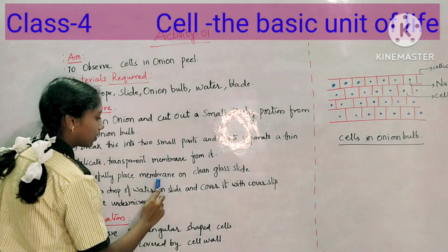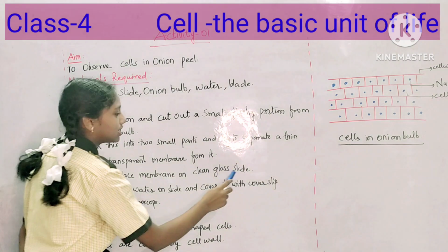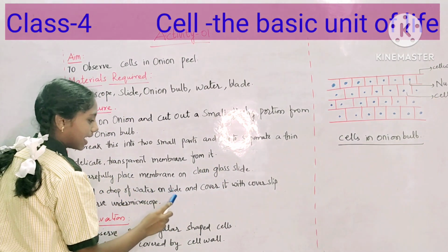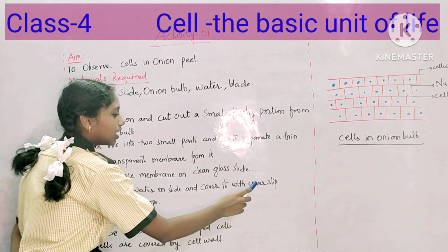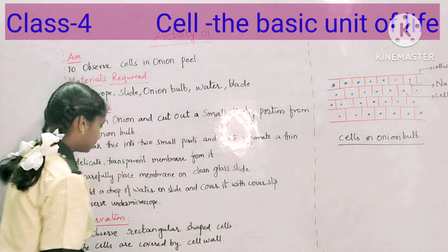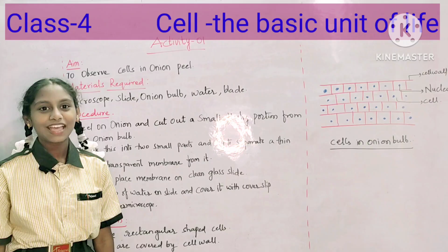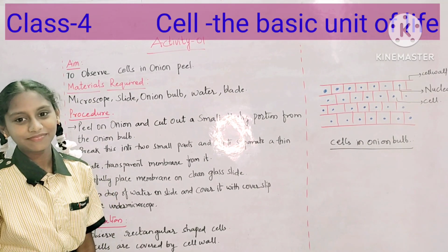Carefully place the membrane on a clean glass slide. Add a drop of water on the slide and cover it with a cover slip. Observe under the microscope.